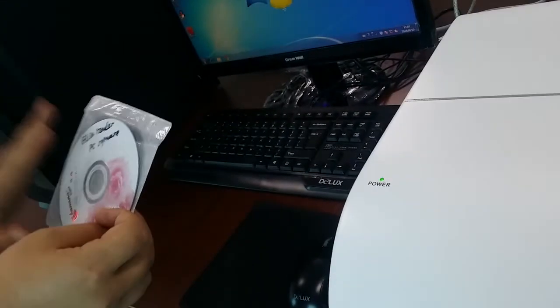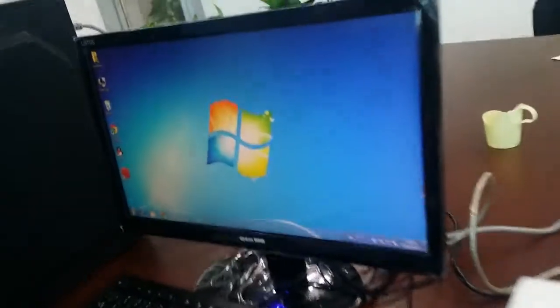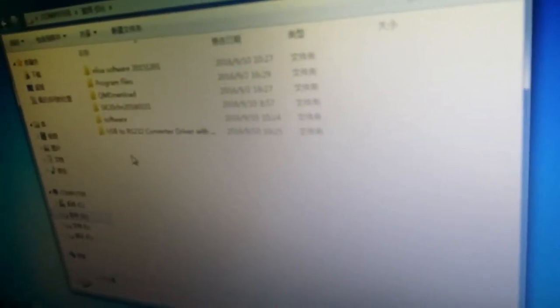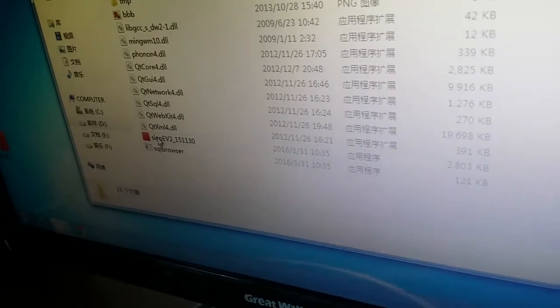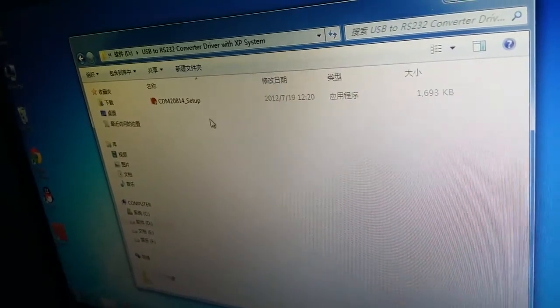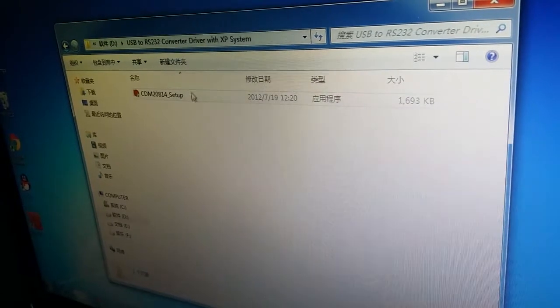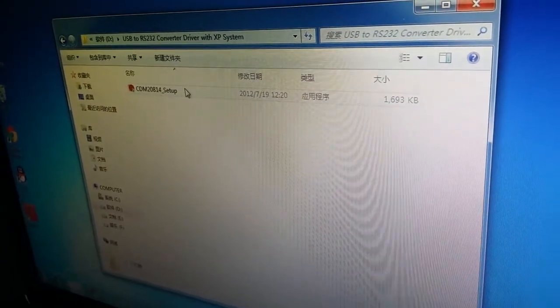Let me show you how to install this software on the computer and how to test with our machine. First, you should copy our software to the D drive. You will find two software items — one is the Elisa Red software. You should also copy these configuration files to the disk. Then you should run this second software, because it is the RS232 converter driver for the XP system. This is required for the machine and computer to communicate. If you don't run this, they will not connect properly.